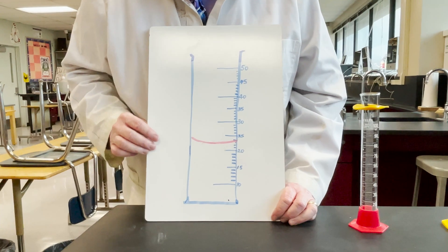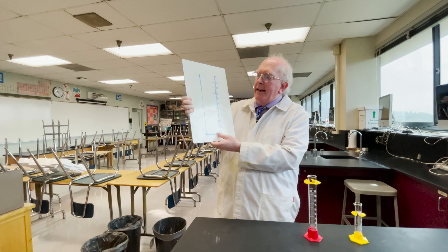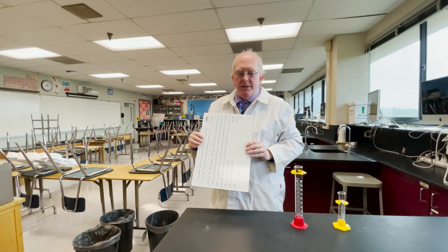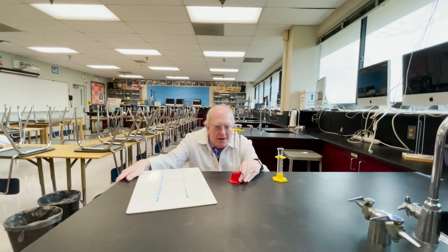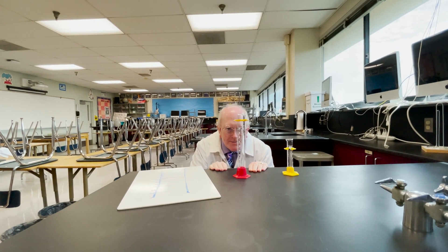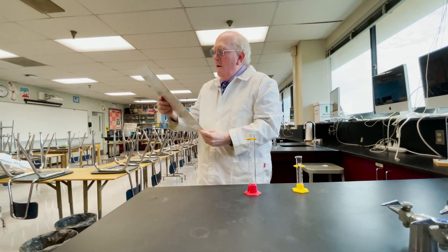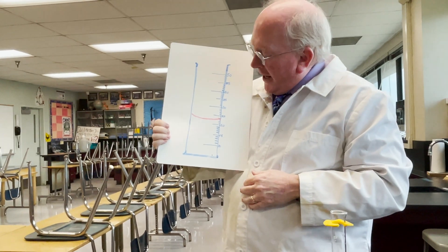You get the idea. When you want to look at the reading, you need to be looking at it straight on. What often happens with these graduated cylinders is you will find yourself getting down on one knee and looking at the liquid straight on. We read from the bottom of the meniscus.